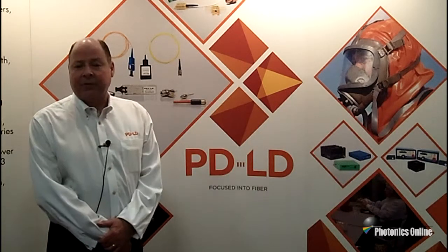PDLD is a manufacturer of stabilized laser sources and patented volume Bragg grating technology that we incorporate in lasers for high-performance spectroscopy.